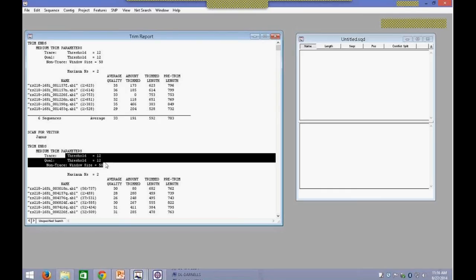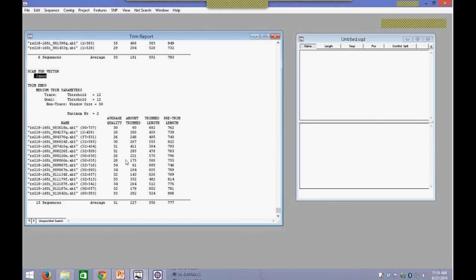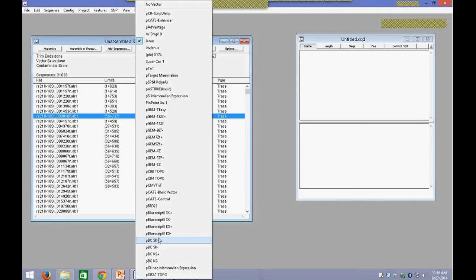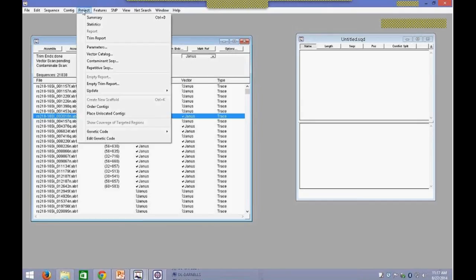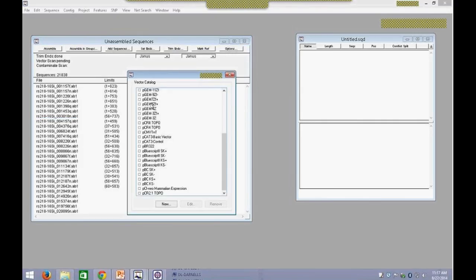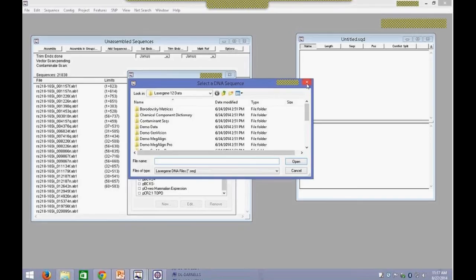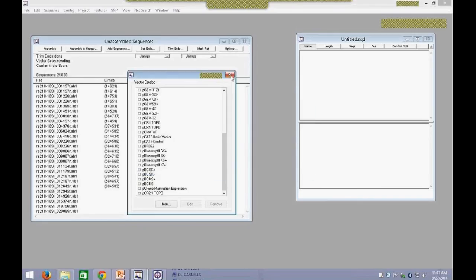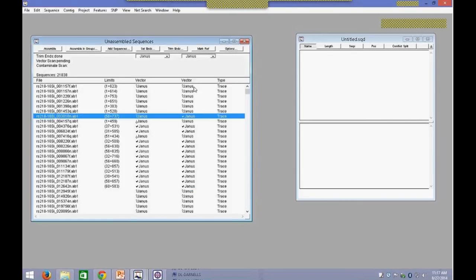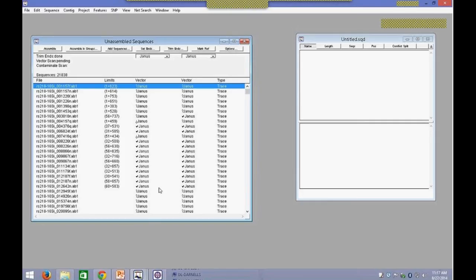If there's a vector you used that's not listed, you can add it easily to the software. All you have to do is go into Project menu, Vector Catalog, click on New, find your vector sequence, and then it will be added to the list for use during the scanning process. This scanning and trimming was done before the assembly. If you choose not to do it before, you can simply select your vector and when you click on Assemble, it will automatically do the trimming and vector scanning during your assembly process.